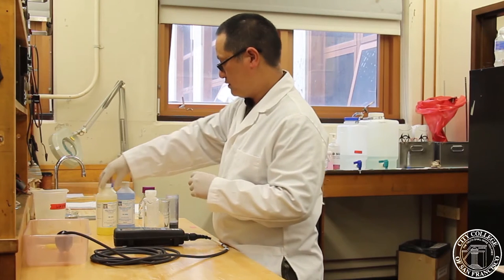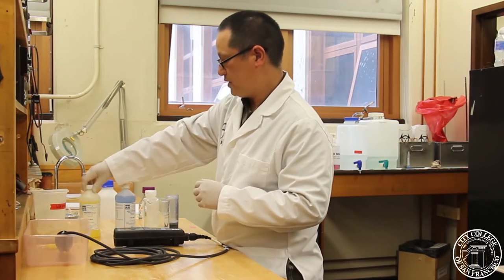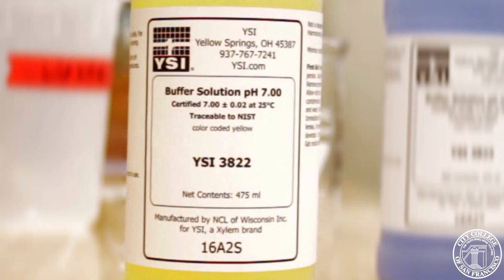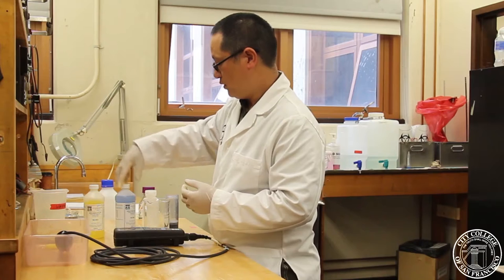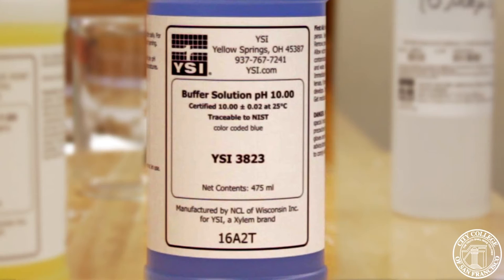And we have two standards that we're going to be testing. One is pH 7, which is in yellow, and the second one is going to be pH 10, which is blue. And so it's important to know what water you're testing, because most of the range of the water we were testing out in the field was between 6 to 8.